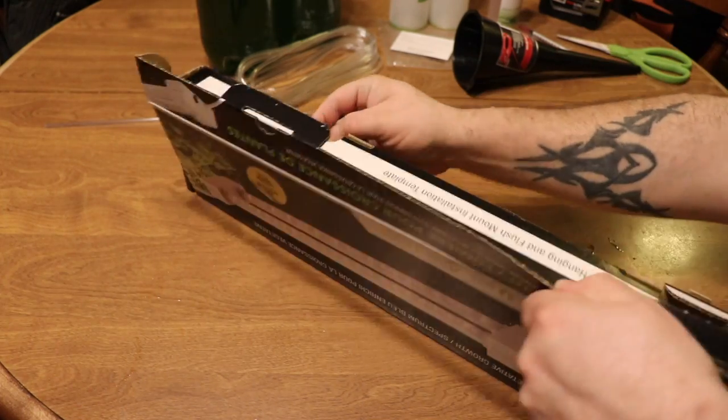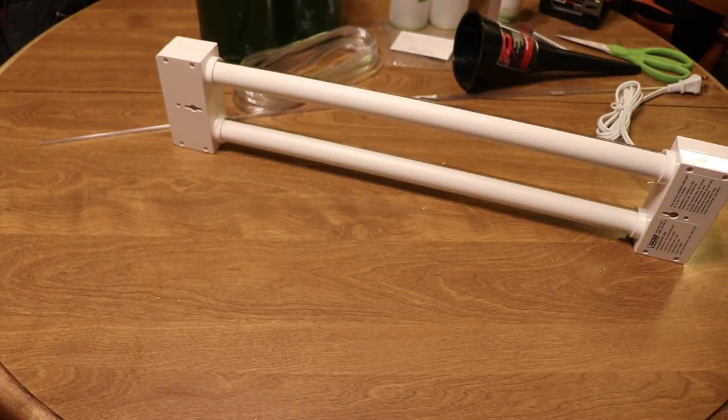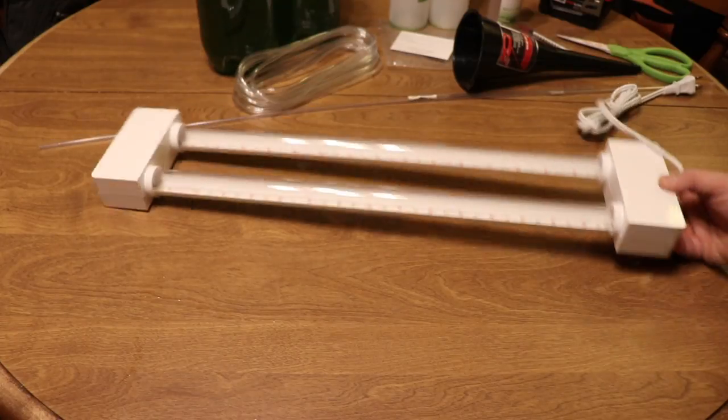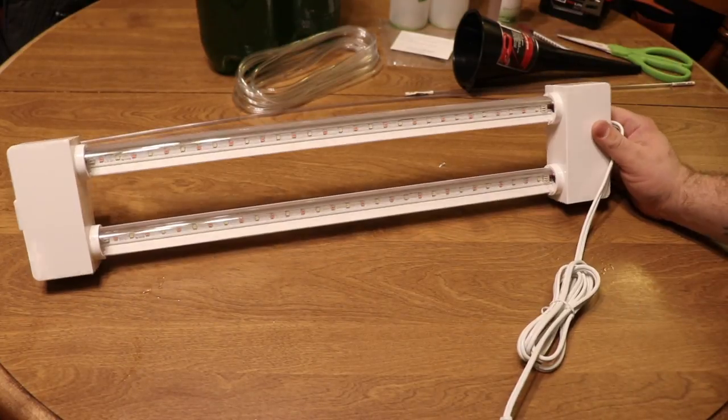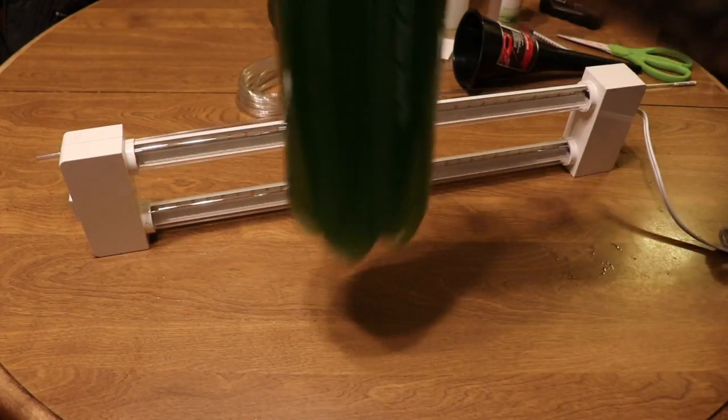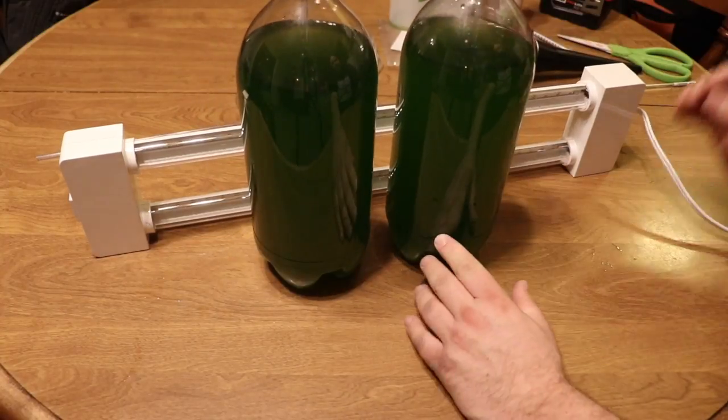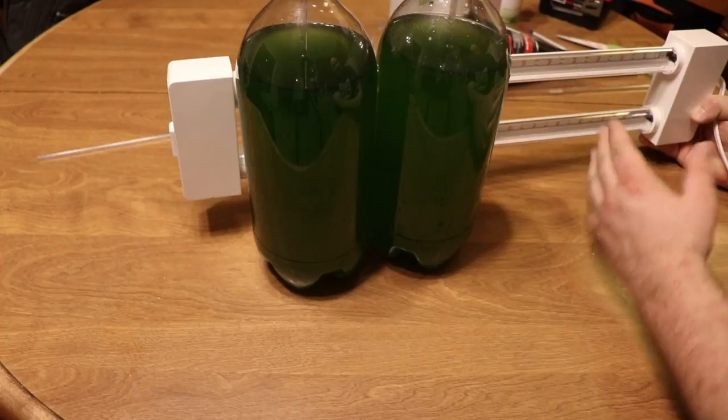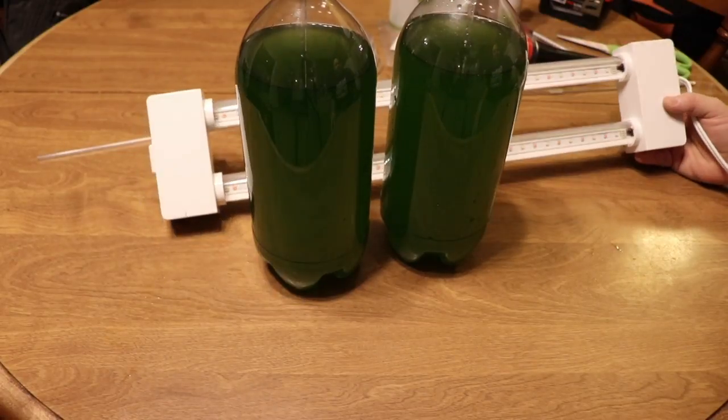There really isn't a whole lot to that. For the price, it feels pretty cheap—it's just a strip of LED lights. I like that you got the switch, you got a good amount of cord there, and you got full spectrum light. The other portion I really like about it is that it can almost be freestanding. I may need to prop it up a little bit just because I want the whole container to be able to get hit, but you can have at least another two easily, maybe with some separation so you can get some reflection going in there. But it's a good amount of phytoplankton just off that one light.